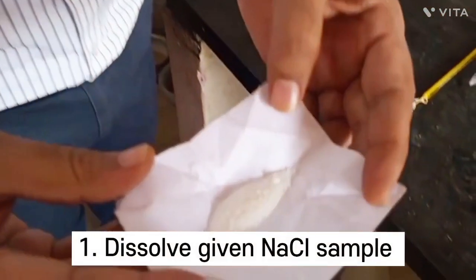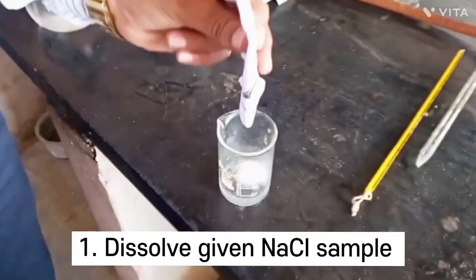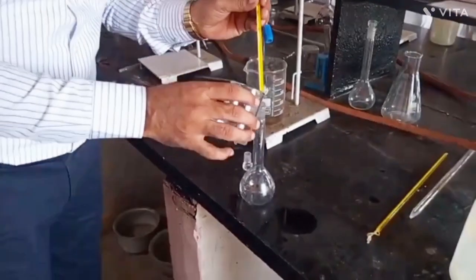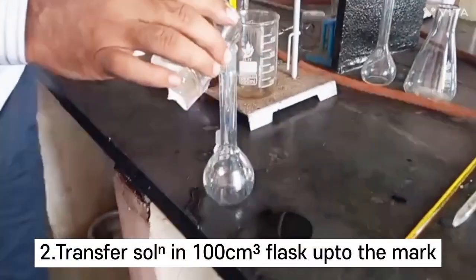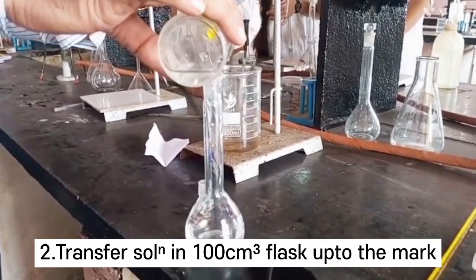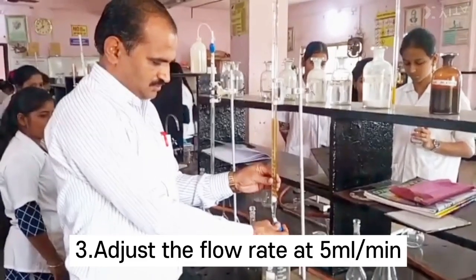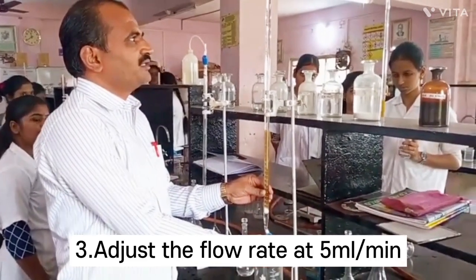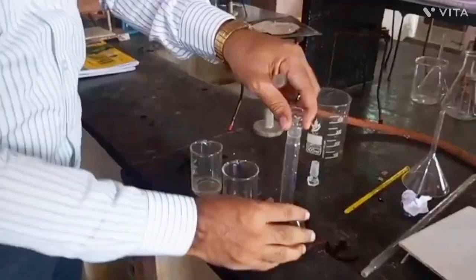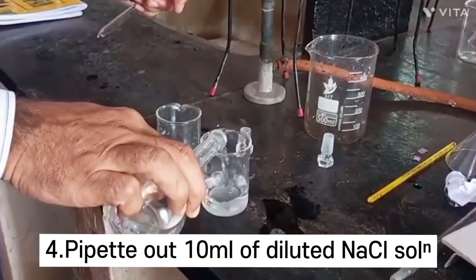The given sample of NaCl is first dissolved in a minimum quantity of distilled water in a beaker. After dissolution, transfer the solution into a 100 cm³ standard measuring flask and dilute it with distilled water up to the mark. Adjust the flow rate of the column at 5 ml per minute, so that the effluent coming out of the column is 5 ml per minute.